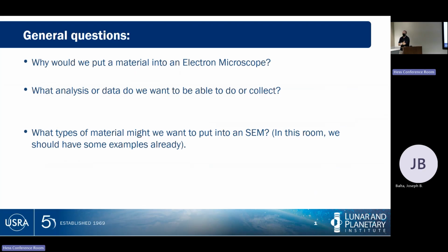And I think this is the set that, in terms of sample prep, these are the questions you always want to be able to answer with some amount of knowledge of what the SEM is doing and what it is you've got. It is, okay, what do we want to actually do with this material? What is the goal of our analysis? That's the overriding question that we want to get.